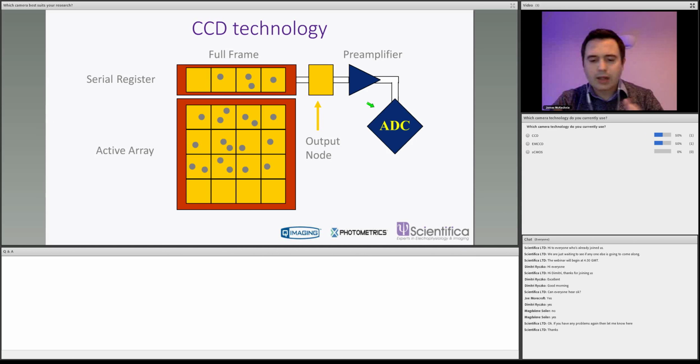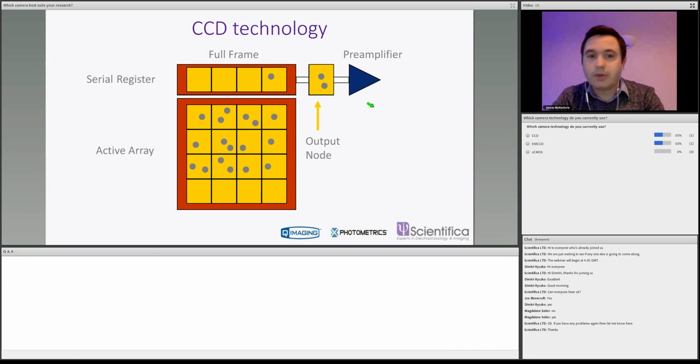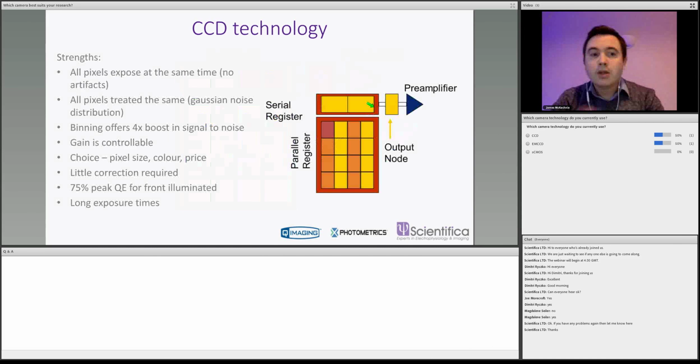Now, other noise characteristics are the dark current, which is dependent on how long your exposure is and how deeply you cool a lot of cameras. But in most cases, if you're doing something reasonably dynamic, then your dark current is going to be quite low compared to your exposure time. And then photon shot noise is the square root of every signal. So really, in most cases, we want to get to the point where we're photon shot noise limited. But we'll come back to that. The point to note here is, as we say, we read each pixel individually through the same ADC.